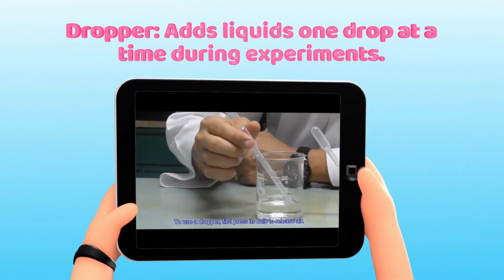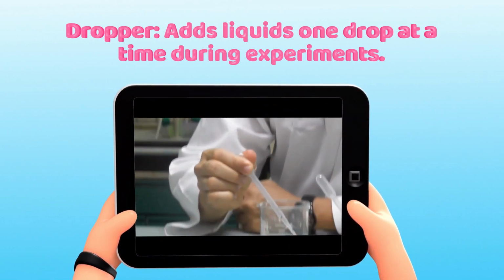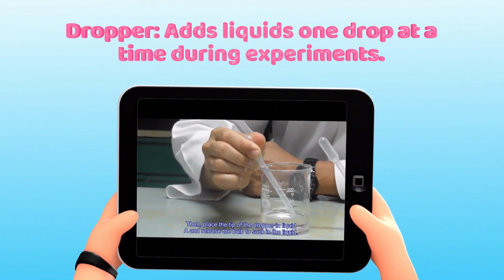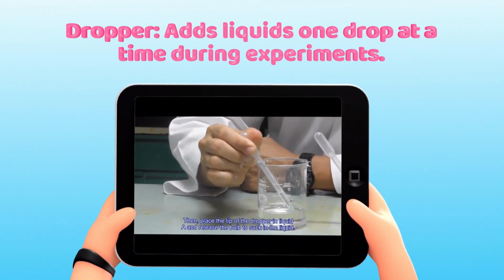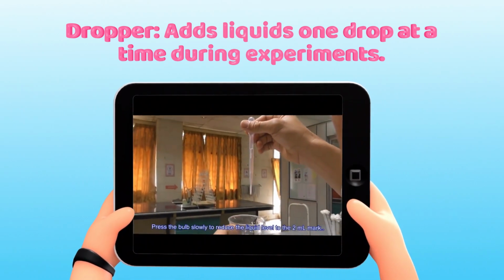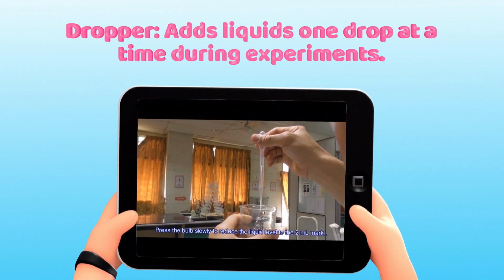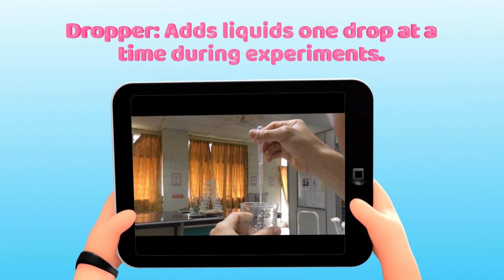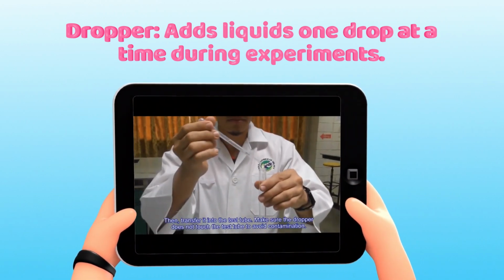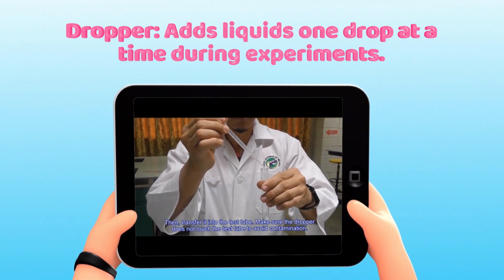Another apparatus is a dropper. This usually adds liquids one drop at a time during an experiment. For example, if you want to mix two chemicals, chemical A and chemical B, you will use the dropper to transfer liquid from one apparatus to another apparatus.